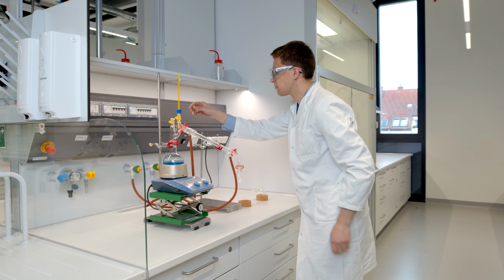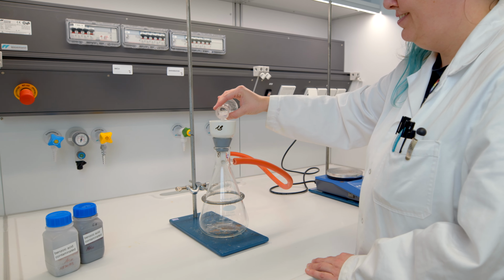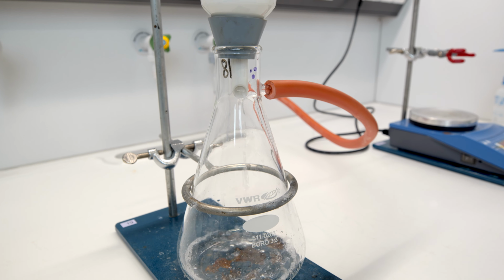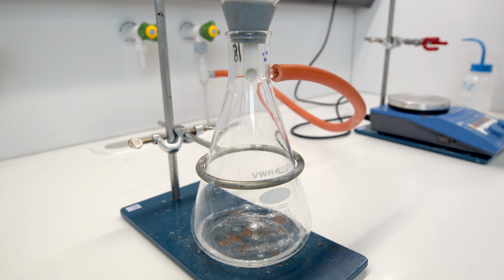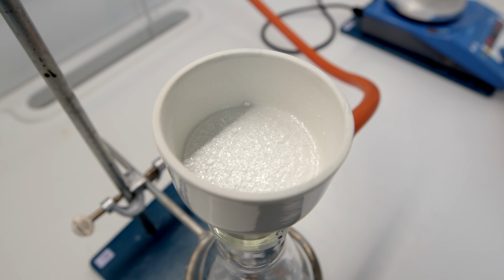Purification is an essential part of chemistry and of every experiment. What you see here is recrystallization. If you want to purify a solid compound, recrystallization is the method of choice and also one of the really important tools when it comes to industrial processes.